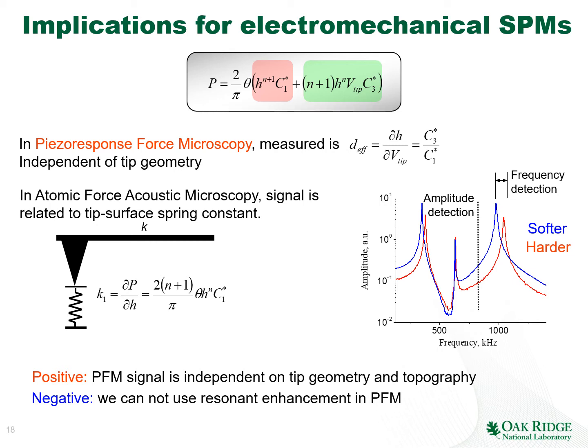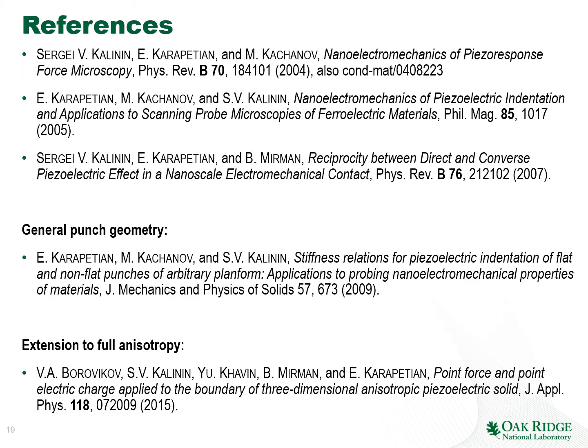So the surface oscillates with the same magnitude, but the cantilever displacement is determined by this transfer function, which is dependent on whether the material is soft or hard. And throughout this lecture and next lecture, we are going to look into this in more detail. So again, there are several references.